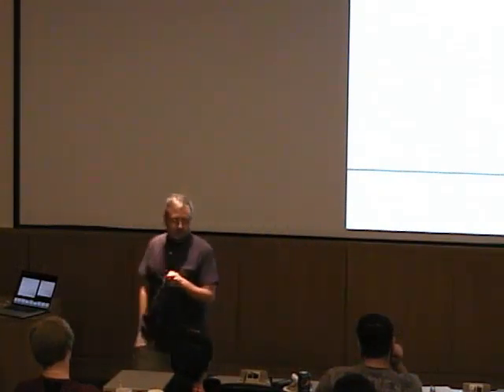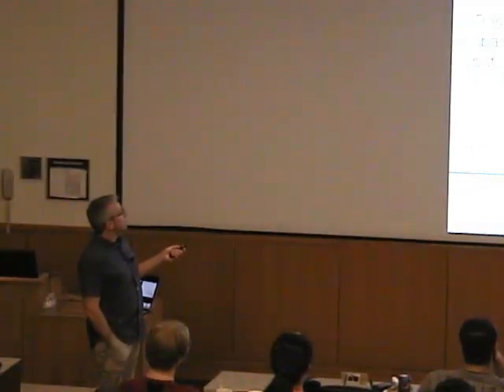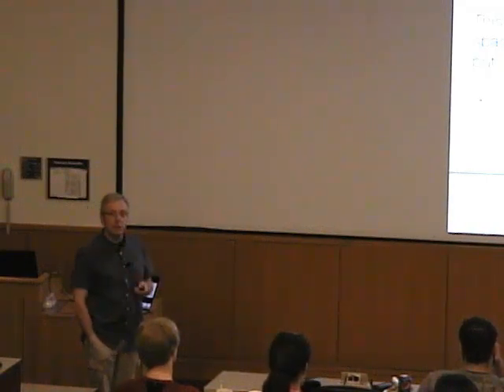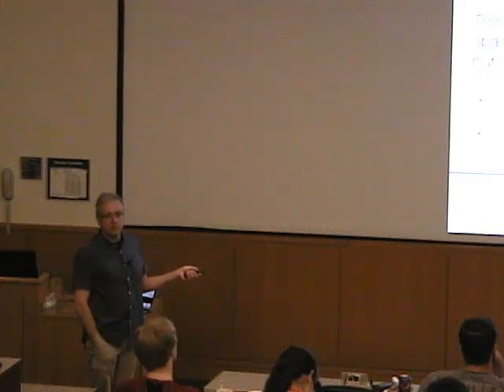But now, what does that function give you? Well, this Patterson function opens up a new type of space that we call Patterson space. Okay? And in this Patterson space, we do not have maxima that correspond to atom positions like in the electron density map, but we have maxima that correspond to interatomic distance vectors.